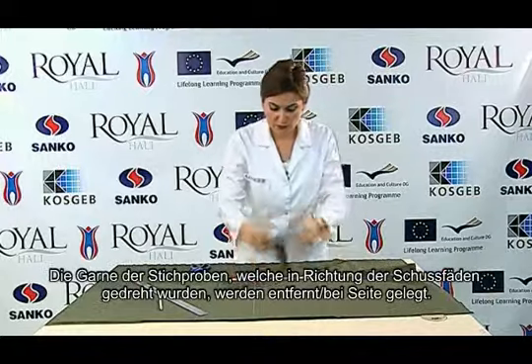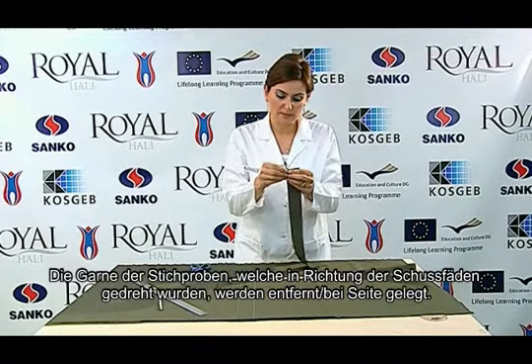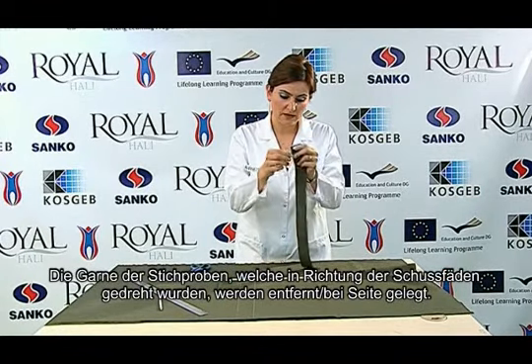The yarns of the sample that are drawn in the direction of the weft are removed.